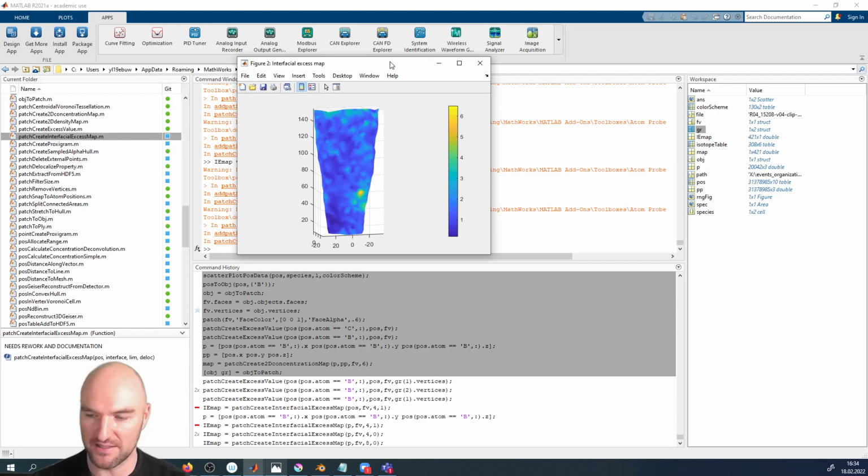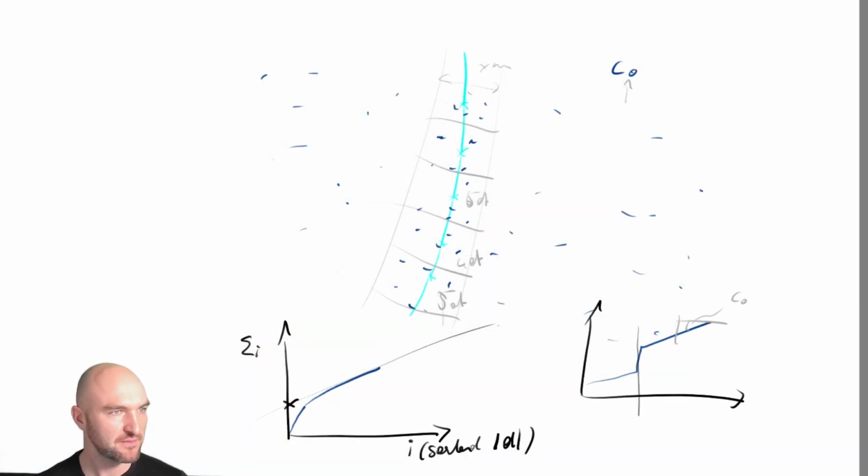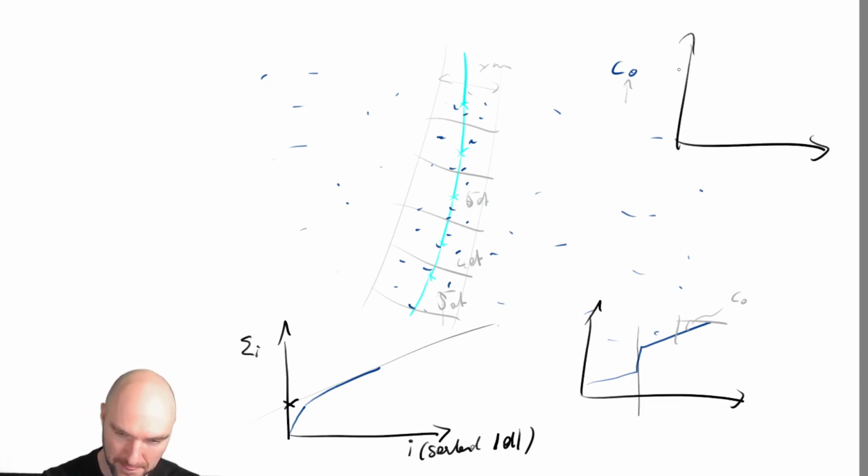Of course, if you've got an interface with a concentration profile that looks like this, of course you need to make sure that you're only looking at the interface.